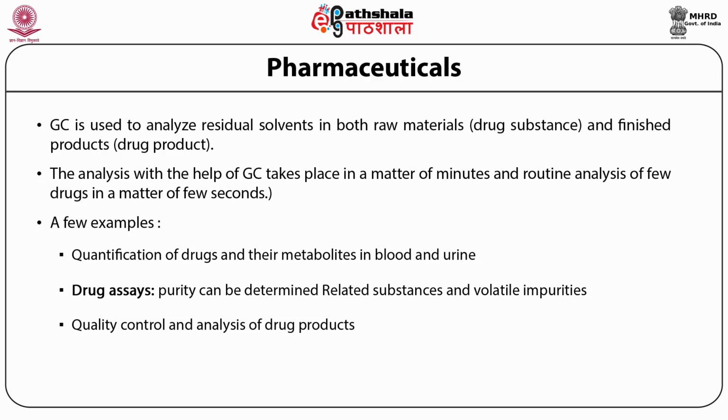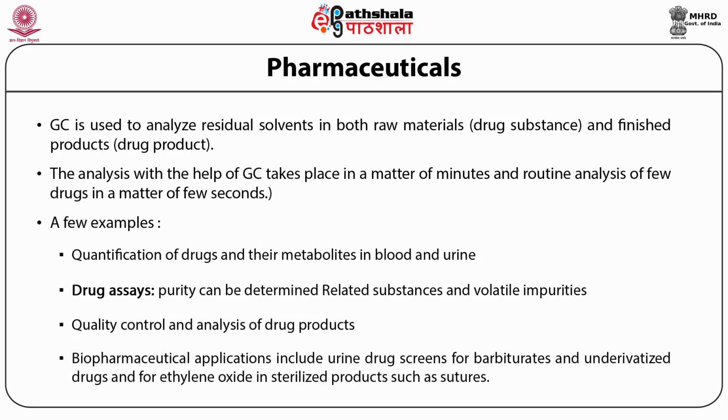In drug assays, purity of a compound can be determined for drugs like atropine sulfate, clove oil, stearic acid, etc. It has many biopharmaceutical applications, including urine drug screens for barbiturates and for ethylene oxide in sterilized products such as sutures.